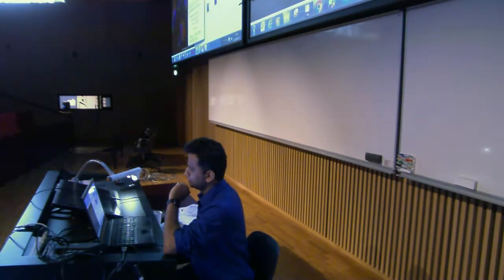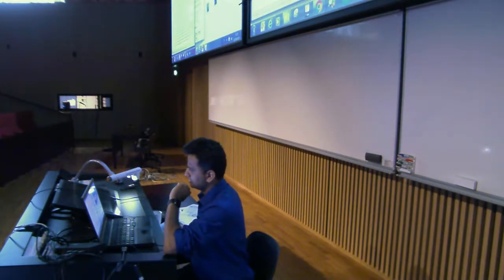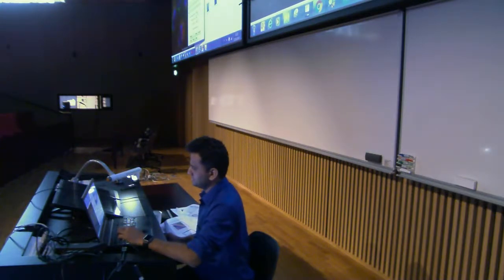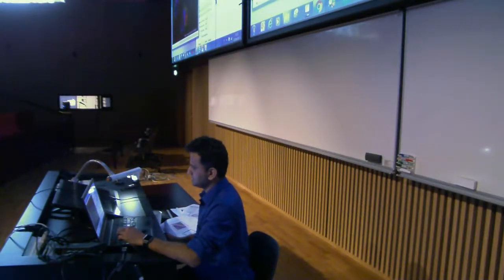There are 2 ways. There are different color spaces, right? Again, I have actually covered this in the PDF. We are interested in RGB color mode. Okay, RGB color mode. Switch off, and sometimes it works, sometimes it doesn't work, because it's a bit advanced level.